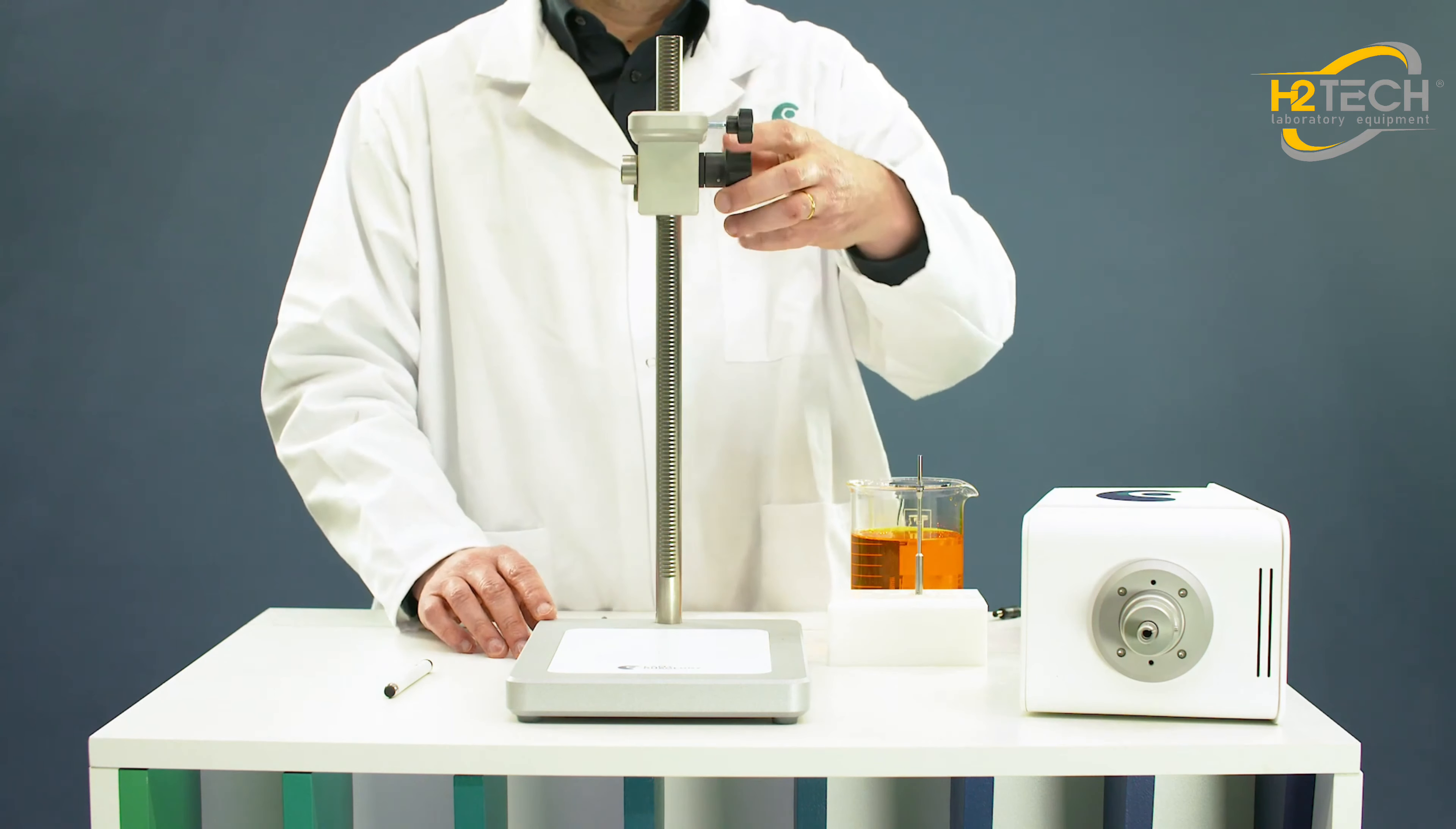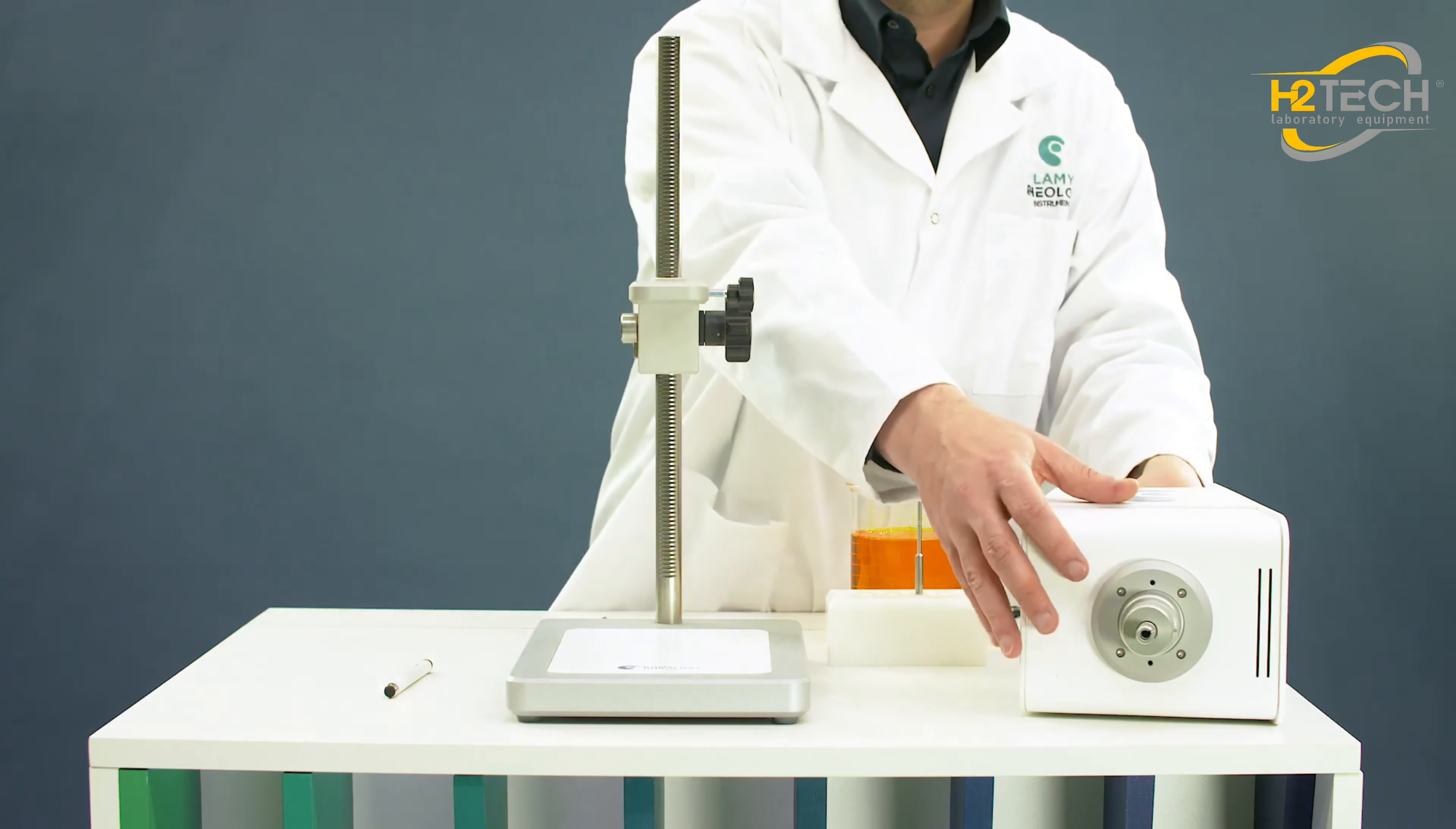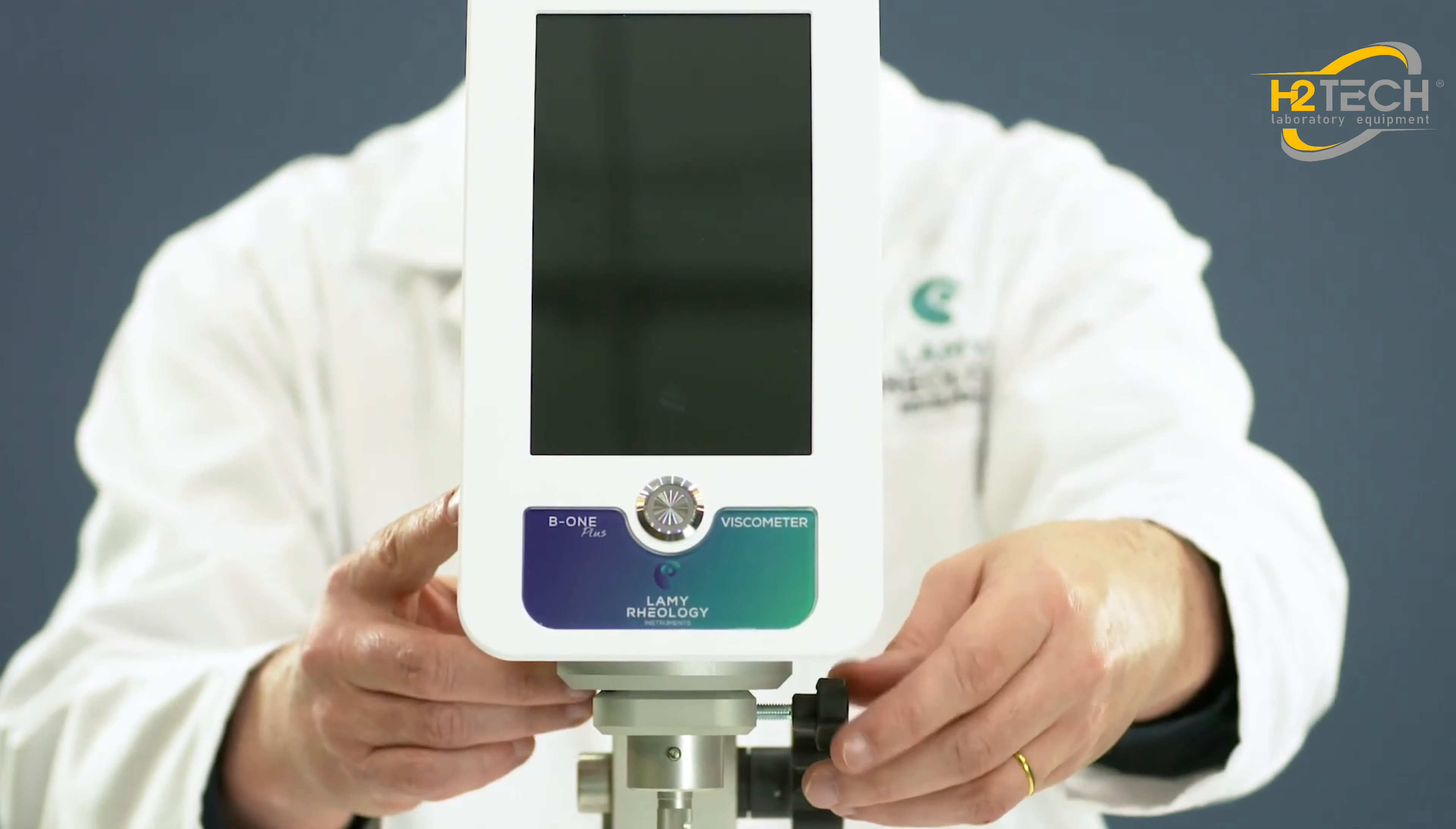Move down the rack stand. Take the measuring head and install it on the arm. Lock the measuring head with the screw.